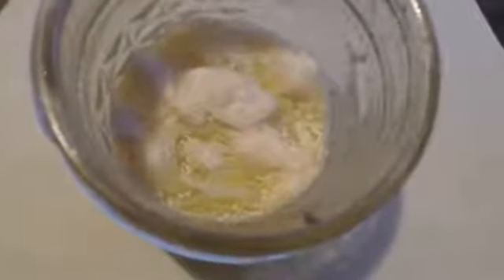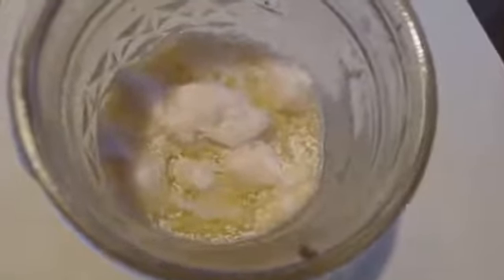And I think the brownish white is maybe ammonium sulfate. I'm not actually sure. I can't remember. But if you notice, I let these dry really slow. And look how there's clumps. See how you got pink here, pink there, pink there. This is all white, yellow, white, yellow. See how it's split up into different areas.